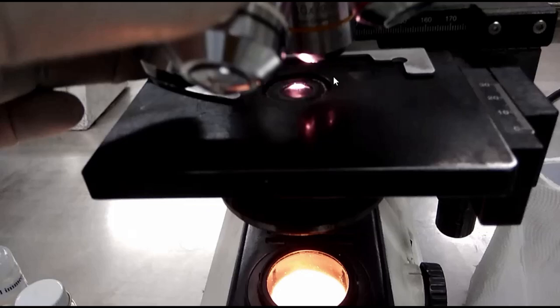Now about the microscope optics. Optics means light. These include the objective lenses, this one, the objectives, and this one is the eyepiece, the condenser and the illuminating source.